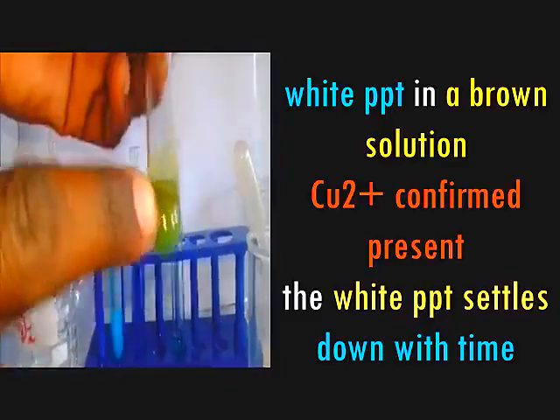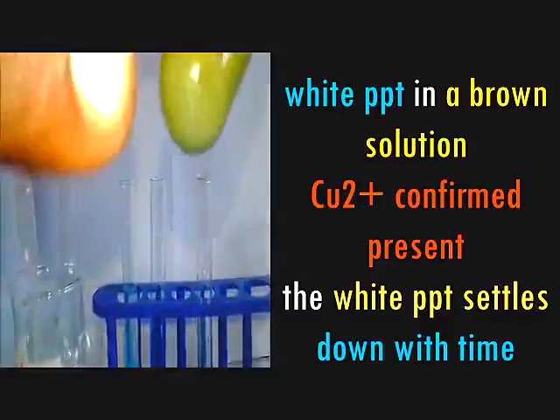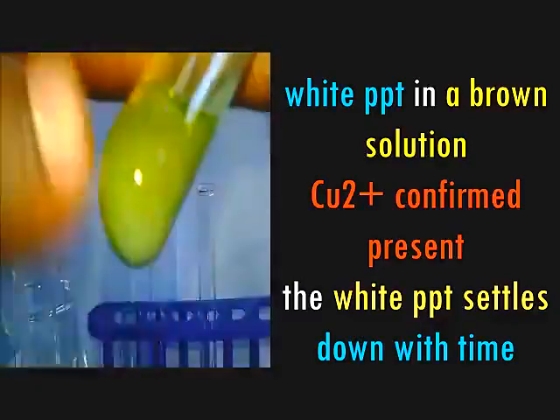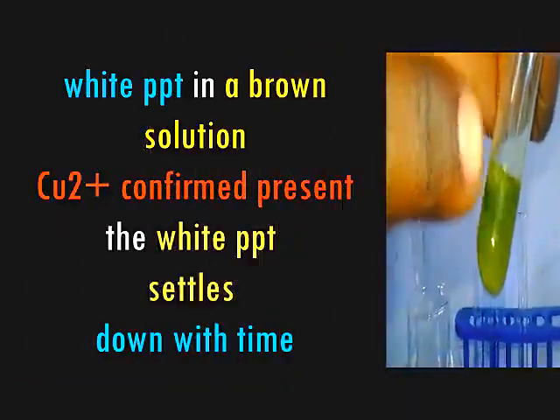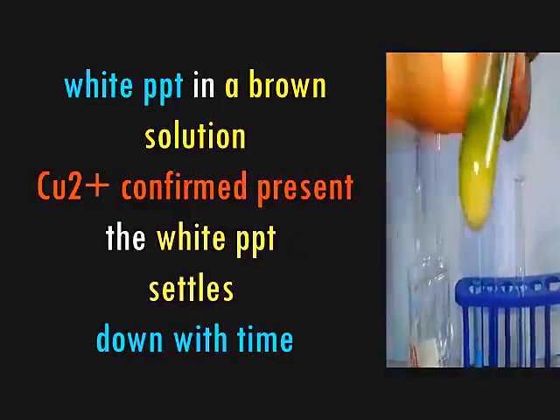yellow or brown solution, but if you try to observe down here, you can see that the precipitate is white in color. Or let me say they are colorless. So they are white, and the solution is going to be brown or yellow. So you are going to record and say white PPT in a yellow or brown solution. And here I can say copper 2 ions confirmed present.